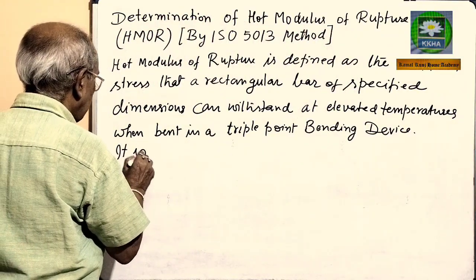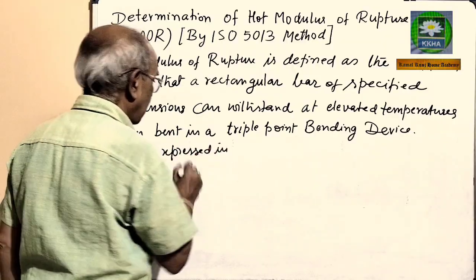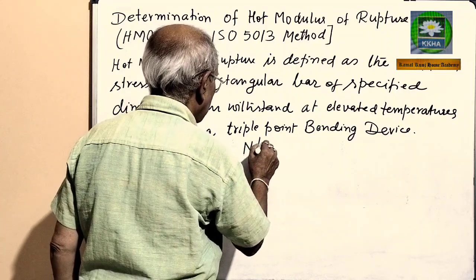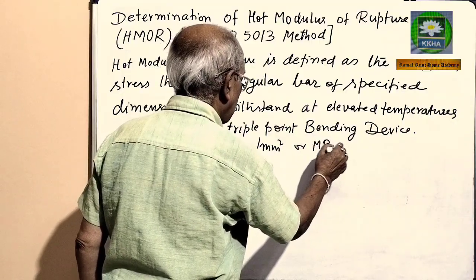It is expressed in Newton per millimeter square or MPa.